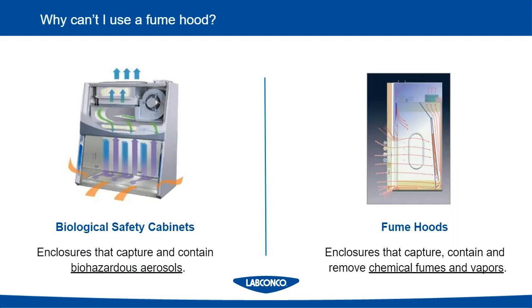So one of the first questions we often get is, can I use a fume hood or can I use a biosafety cabinet, or which one do I need? So before we get too far into the talk, I want to outline a little bit about the differences between a traditional laboratory fume hood and the biosafety cabinets that we're going to be talking about today.